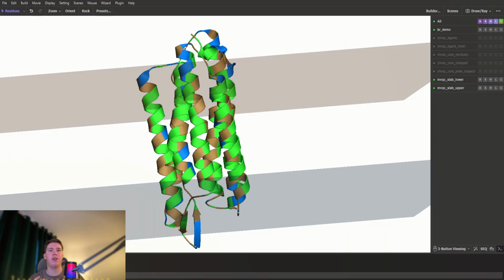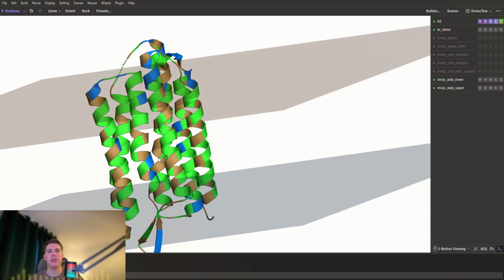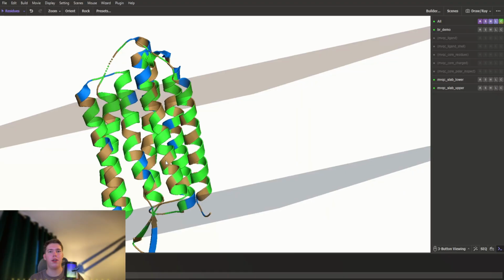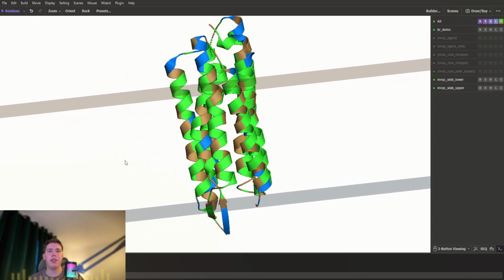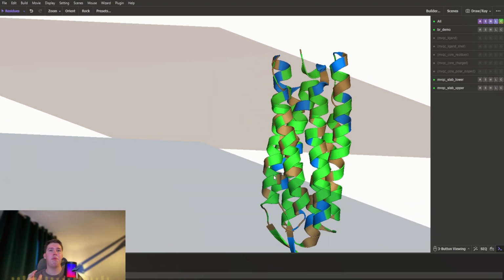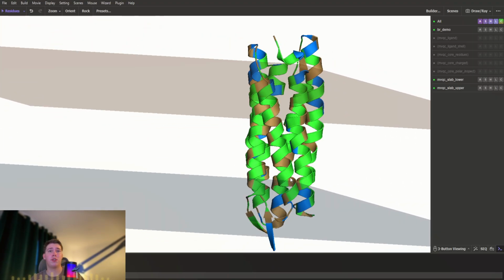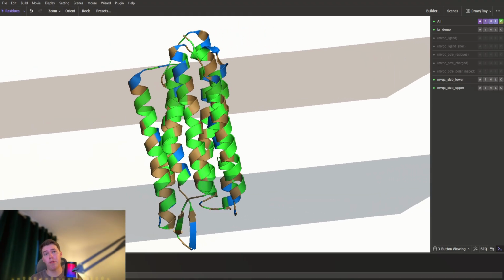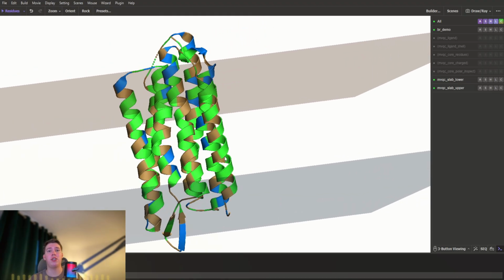And that brings me back to the most important design decision in the project. Membrane Visual QC is not trying to replace scientific judgment. It doesn't look at the structure and declare, this protein is correct. Its job is more narrow. Put the structure into membrane-aware geometric context, make interesting chemistry easier to inspect, keep track of where the orientation came from, surface review items, compare orientation sources when that comparison is meaningful, and leave behind enough structured information that the analysis can be reproduced later. A scientific tool should make evidence easier to reason about. It shouldn't pretend uncertainty doesn't exist.